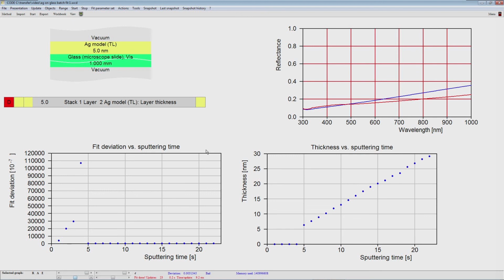I would like to show you a systematic search for the thickness. Right now, if we do the batch fitting, the program just starts at the current value, and then it runs the downhill simplex algorithm. So if I press start here with this thickness, the program does some small steps, and it tries to fit this spectrum. Sometimes that's okay if we are close to the best value. Doing small steps, starting from there, is okay.